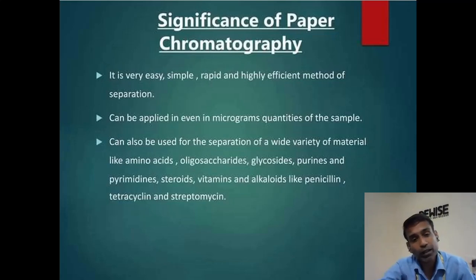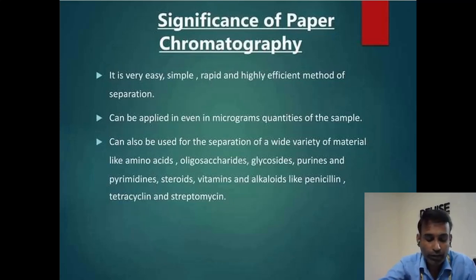Apart from that, chromatographic techniques are used in different sectors of industry, especially the pharmaceutical industries, biotechnological and molecular biological applications. Chemical industries, food industries and forensic science also prefer chromatographic techniques. I hope that these slides, this presentation, will give a basic understanding of the chromatographic techniques related to food industry applications.